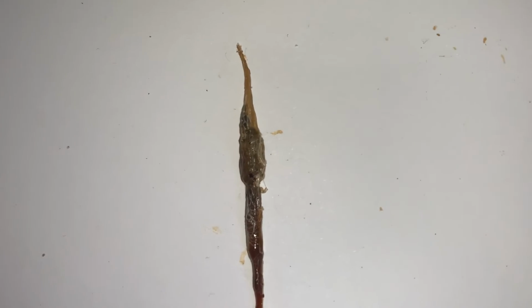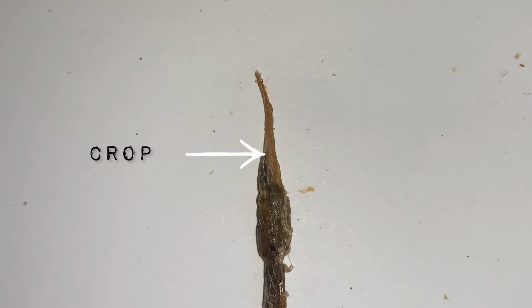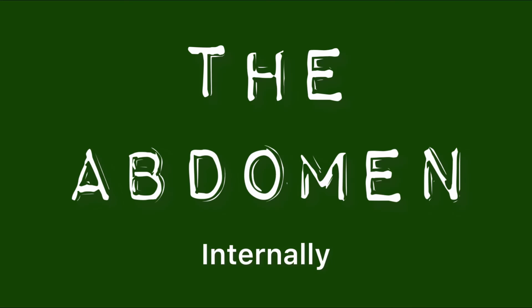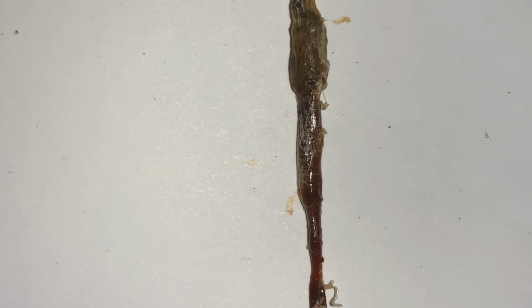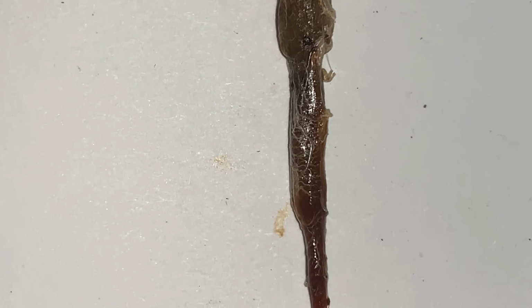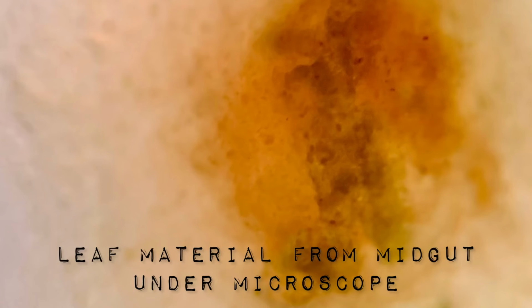The foregut consists of the crop, which is an expandable transparent pouch that fills up with green shredded leaves that the insect eats. This finishes up the thorax, which means we can now move on to the abdomen. The midgut is located in the middle of the digestive system. Leaf matter in this part of the digestive system is much smaller and brown in colour due to oxidation.